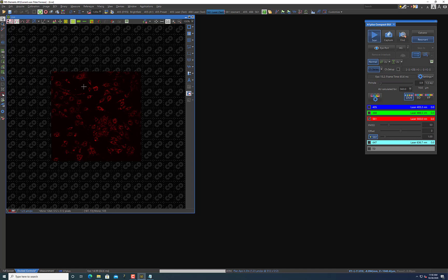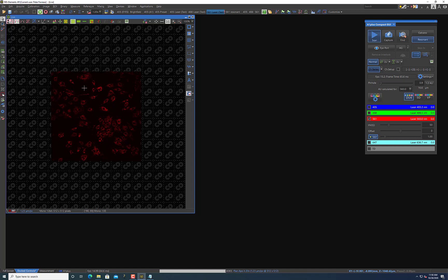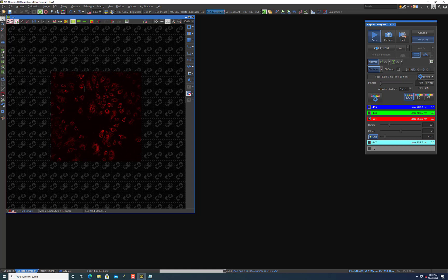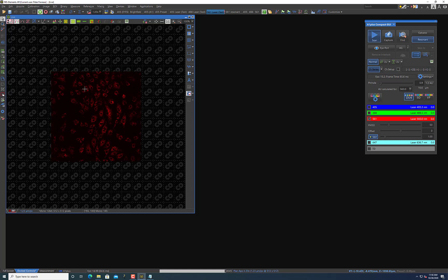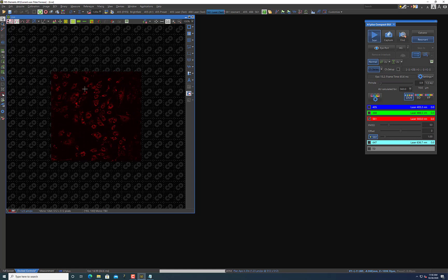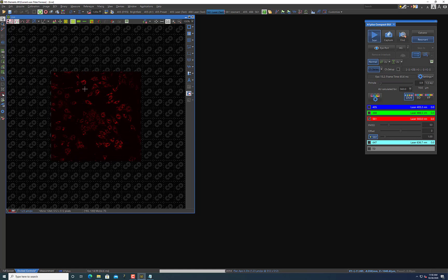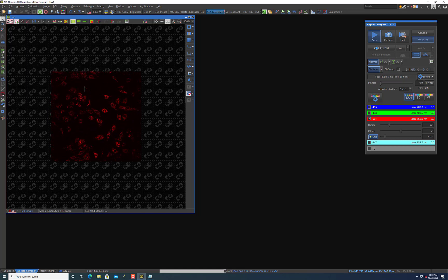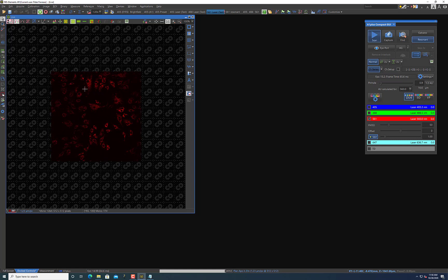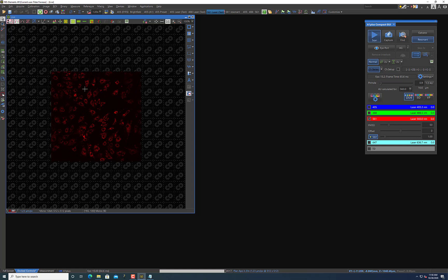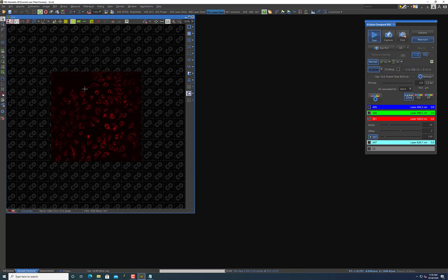So that's why if I move this a little bit, you can see that things move around very quickly. This is a very useful mode to be in for the confocal because as I said, your sample may be quite large and there's a lot of fields of view you want to get through.